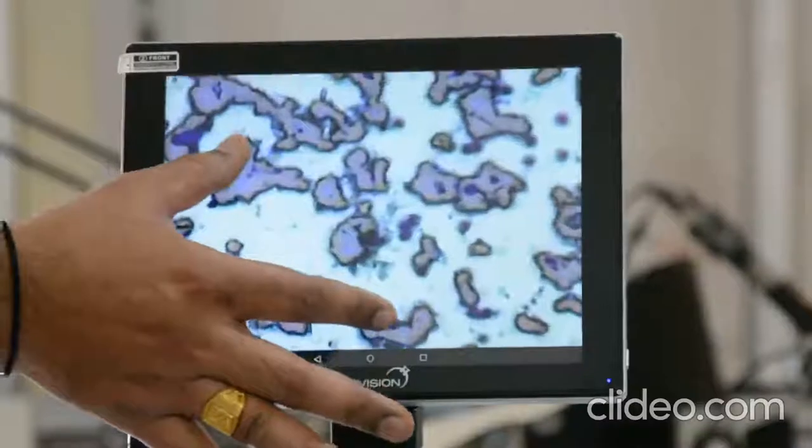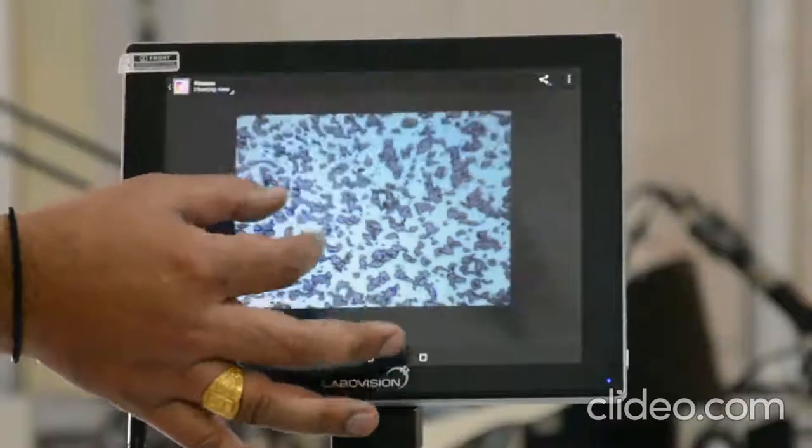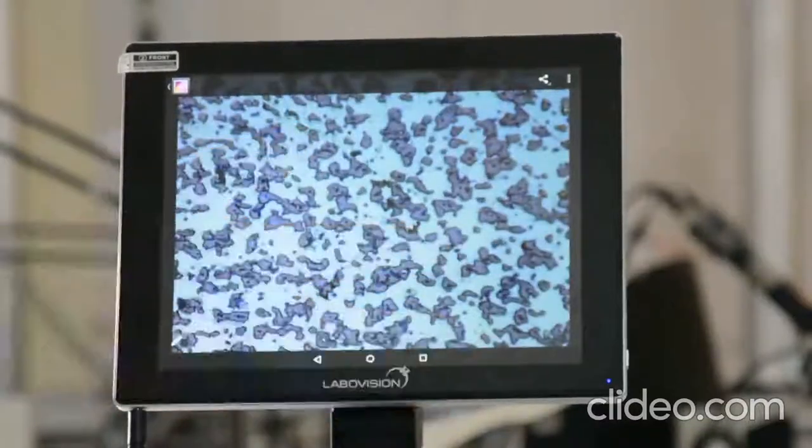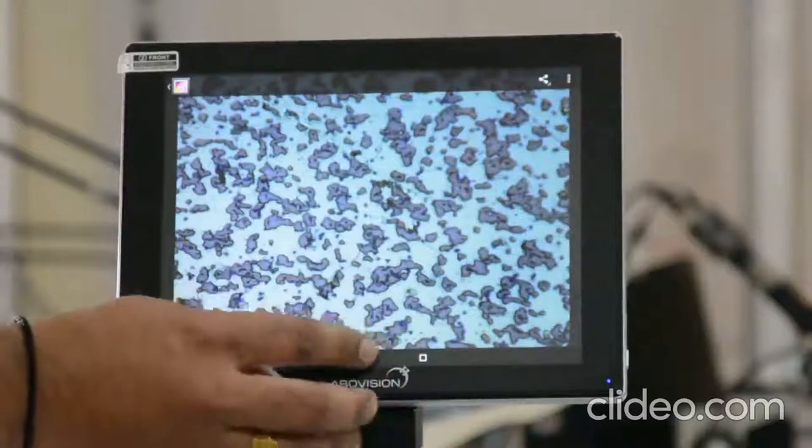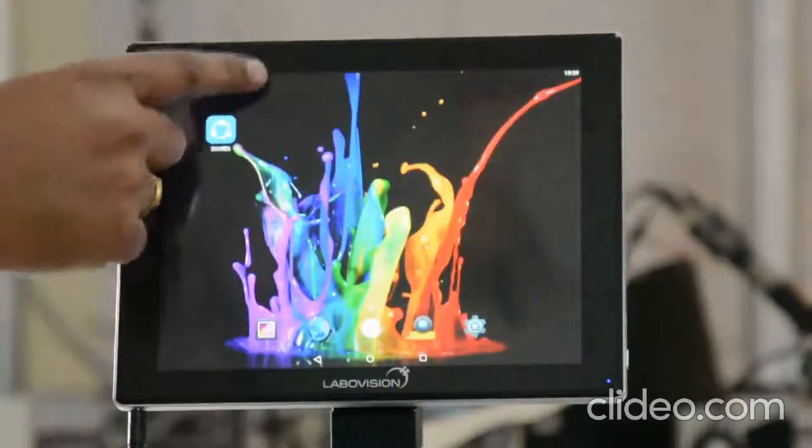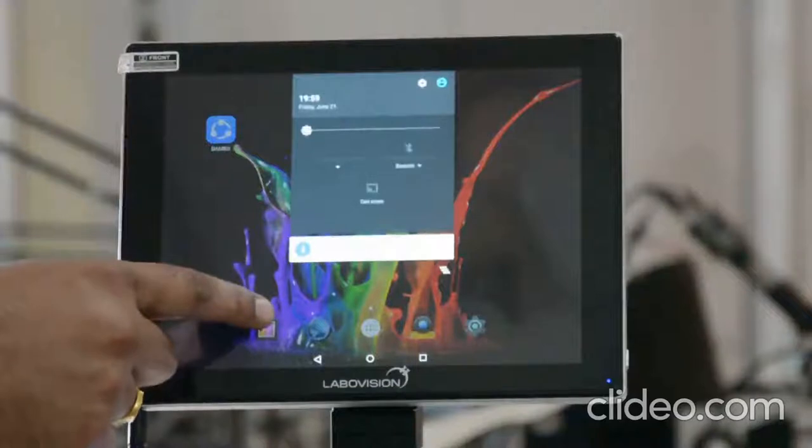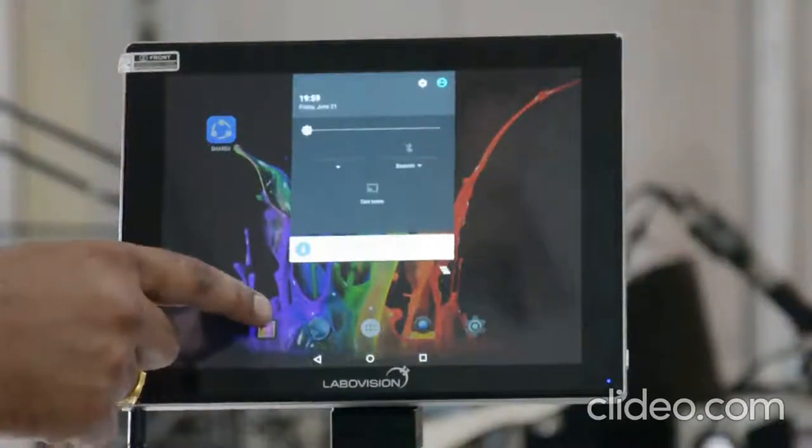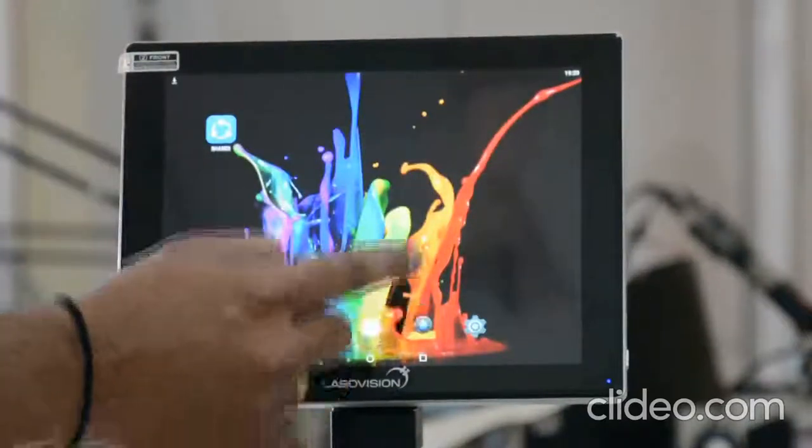You can zoom it and check your specimens easily and freely. If you want to make a video of the same, there is an option. You go back.